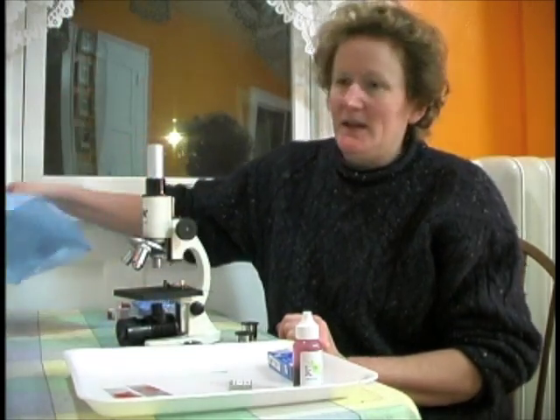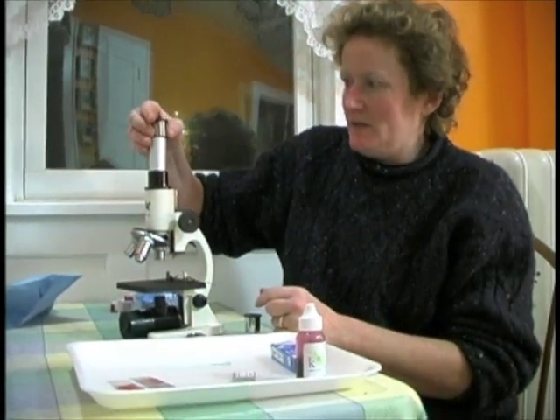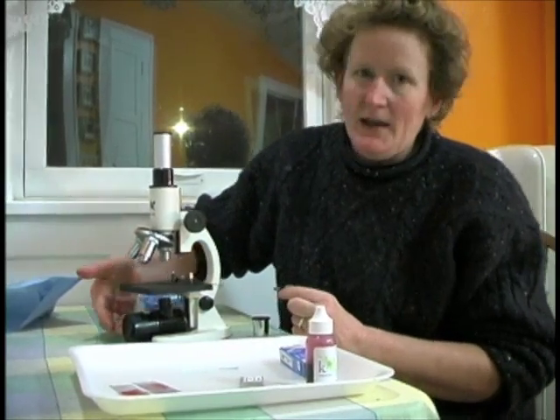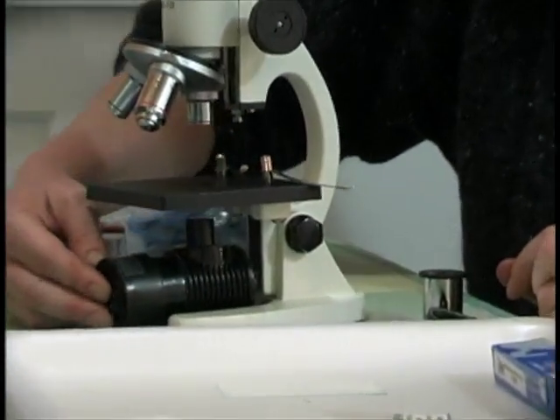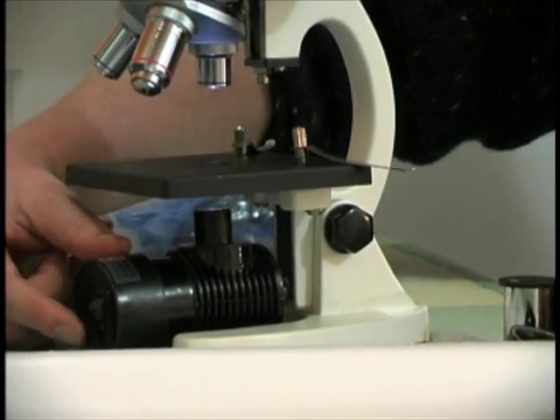I want to get out my microscope by taking off the dust cover. I want to put in the 15x eyepiece. I've already taken the mirror off from the last lab and added the light. Remember you have to charge your light for several hours before it will work. There's a switch right here on the light that turns it on.